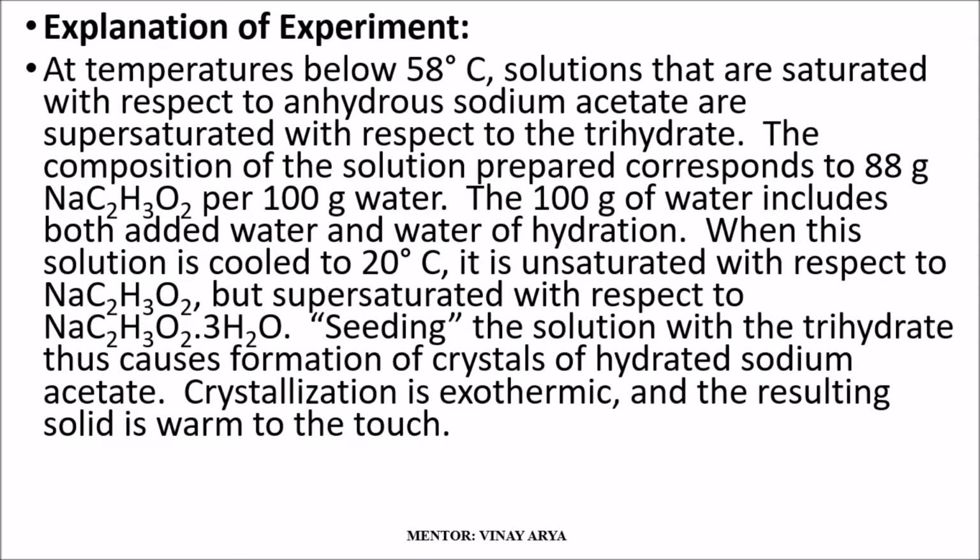The explanation of this experiment: at temperatures below 58 degrees Celsius, solutions that are saturated with respect to anhydrous sodium acetate are supersaturated with respect to the trihydrate. The composition of the solution prepared corresponds to 88 grams NaC2H3O2 per 100 grams of water. The 100 grams of water includes both added water and water of hydration.